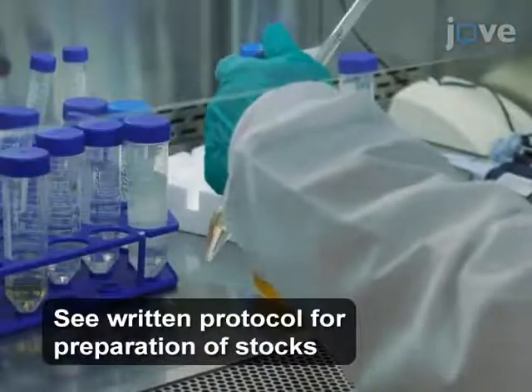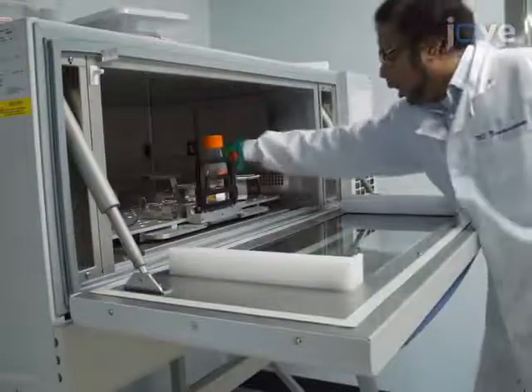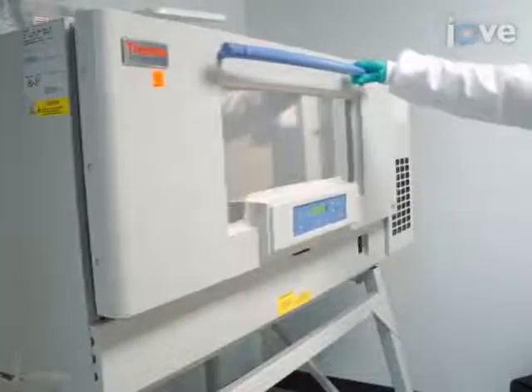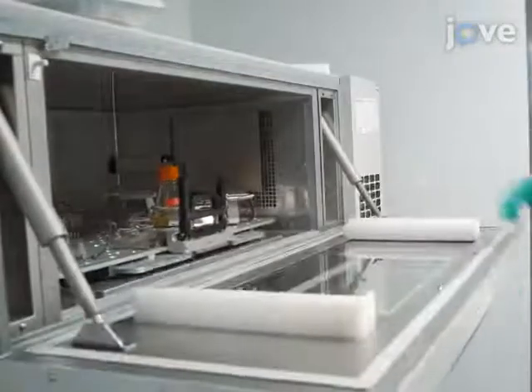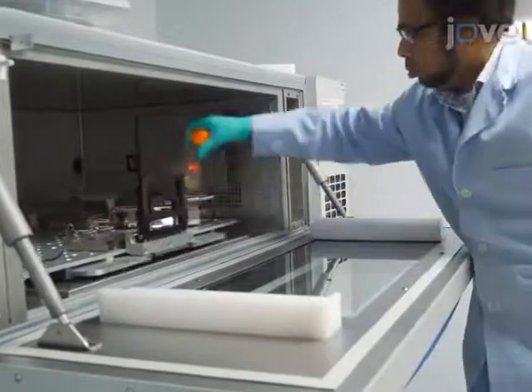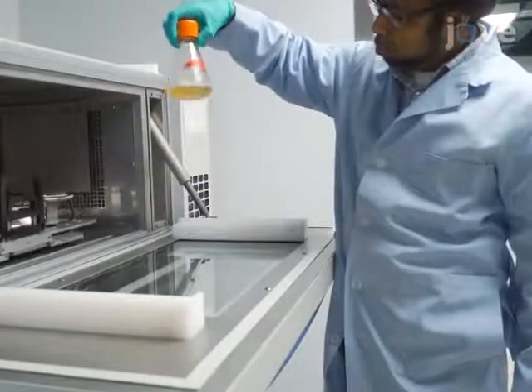Add 2 milliliters of P2 baculovirus stock to the cells and shake at 135 RPM while maintaining a constant temperature of 28 degrees Celsius. 4 days after infection, the entire SF9 cell population will show cytopathic effect, which is an indication of high-titer baculovirus production.